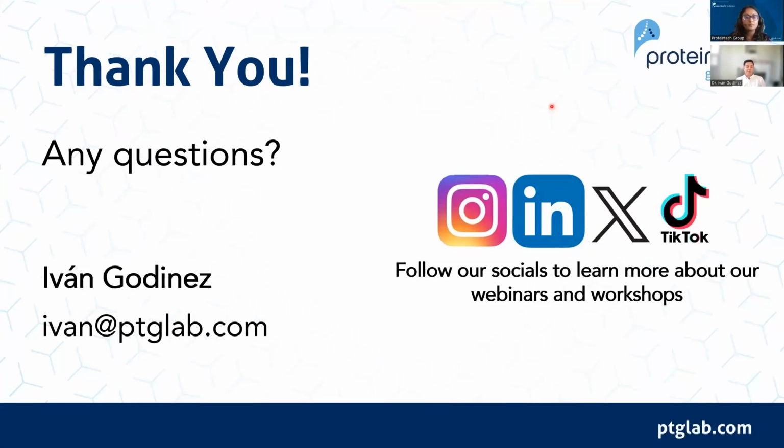That's a really good question, right? We've done experiments where we leave out things like the protein transport inhibitors, to see if there are any artifacts being generated by that. What we've seen is that no, we don't think these are artifacts, based on repeat experimentation and detection, but also even within those same data sets, we do see that in some cells the staining is working robustly in those populations. So that leads us to believe that whatever we're seeing is happening, is real, and is not an artifact.